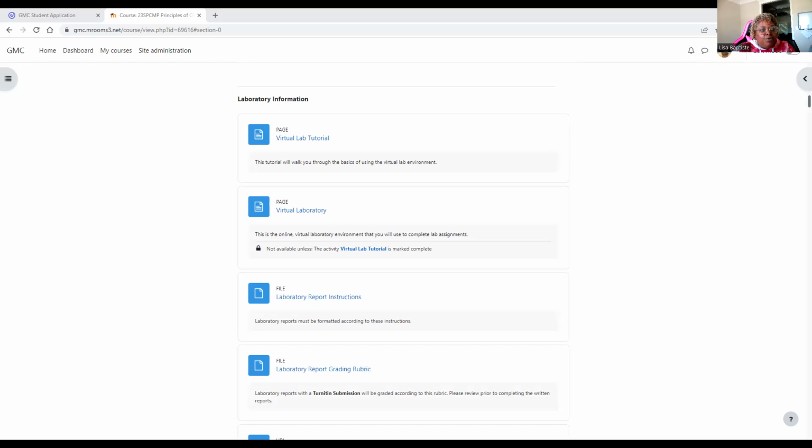And so now we want to pour from our 250 milliliter beaker to our 10 milliliter graduated cylinder. And we want to pour, you can do realistic and just hold and pour. That time it gave you 4.33 milliliters. And according to our instructions, we want it between 2 to 7 milliliters. So that's perfect. So we're going to write down 4.33 milliliters.